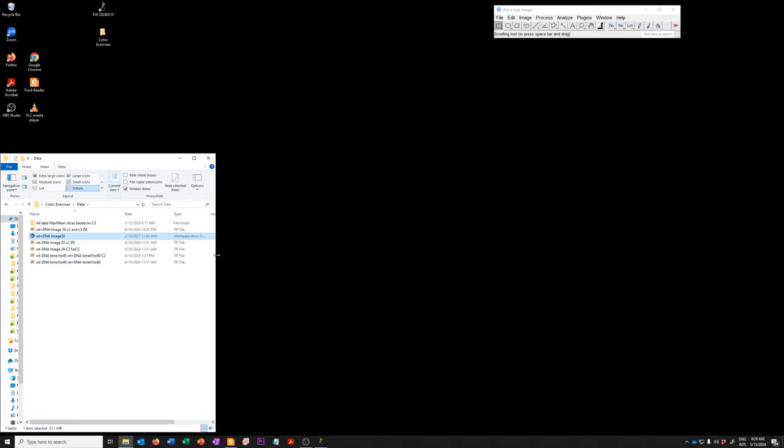This is a .LSM file that came off a confocal microscope in my core facility and is one of the examples of the data in the collaboration paper that I had with Jenny Tinglab at the University of North Carolina at Chapel Hill.